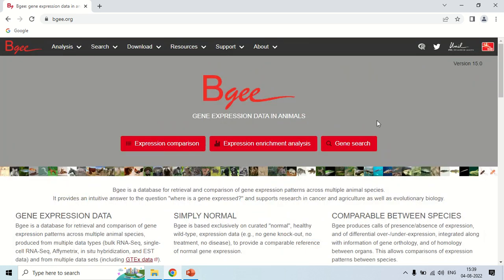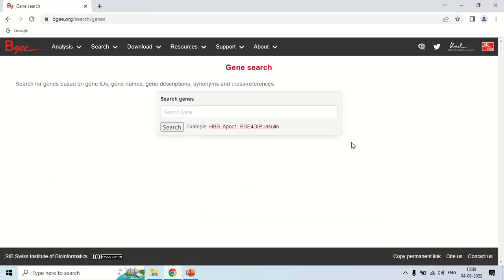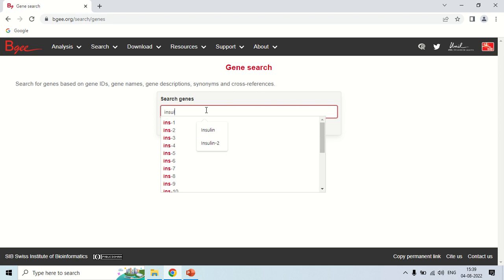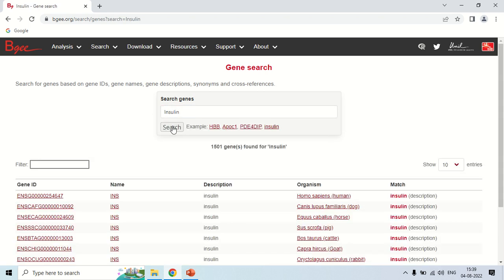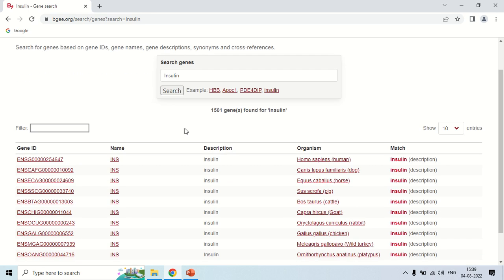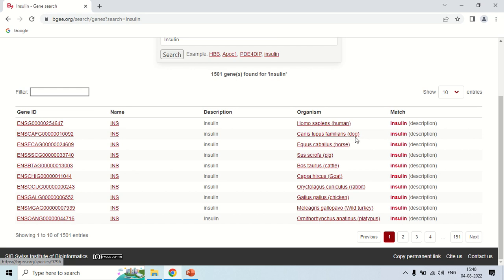Now, to search for a gene, just click on gene search. Enter the name of a gene — for example, I am entering insulin if I want to search about insulin. Pick insulin and search. These are the search results: the insulin gene is present in Homo sapiens (humans), it is also present in dog, horse, and these all are the species.